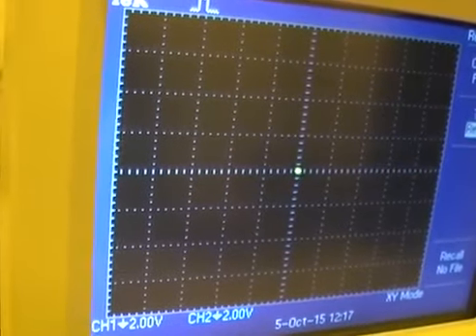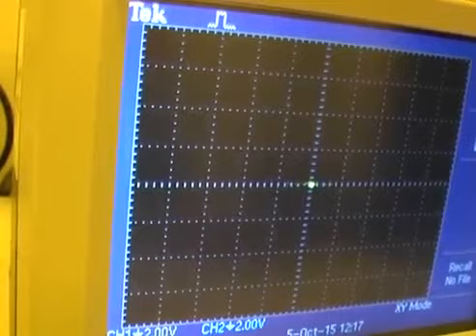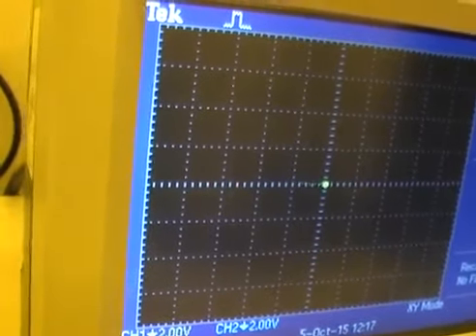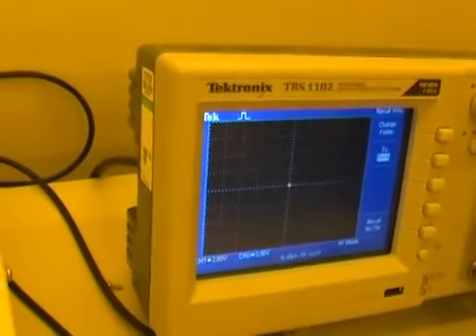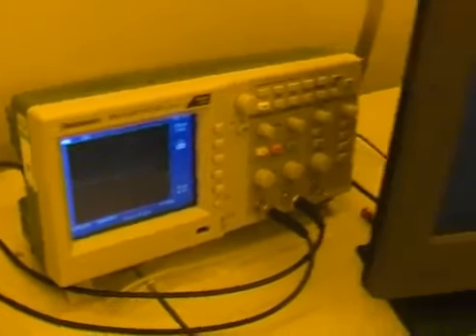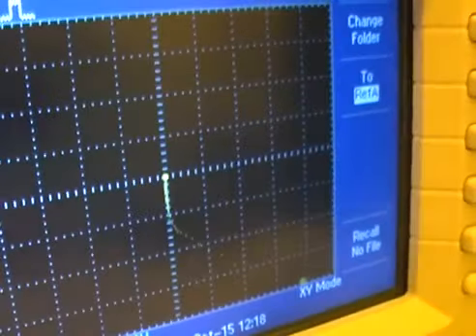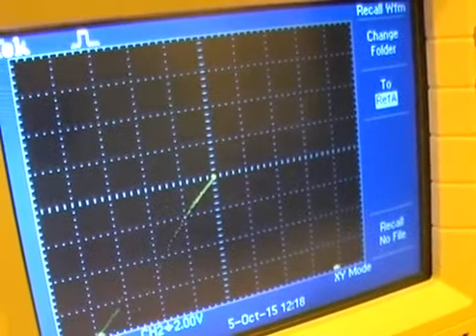In a minute it will be calibrating the main field, and then you will see better what the calibration looks like. I can talk about the main field calibration when it happens. It's quite important. So here it is, main field calibration. You see the spot's going into the corner of the beam. Okay. So you can see the spots going to the corners of the oscilloscope.